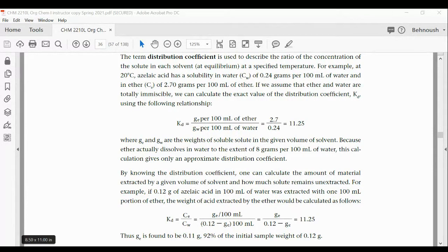What else? Like in this case, ether is the extracting solvent. You have the aqueous layer and you have the ether layer. What are the characteristics for ether that is a good solvent for extraction? Different density, very good. Must have different density because in the separatory funnel, you want to see the separation. You want to see the two layers, organic layer and the aqueous layer.